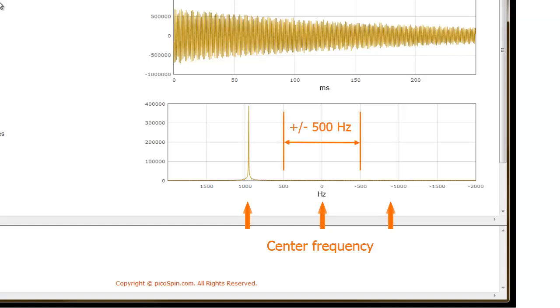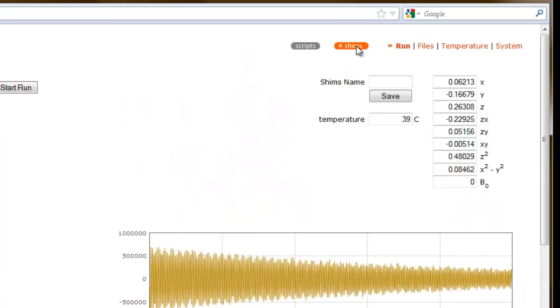For shimming, we need to place our signal within plus or minus 500 Hz of the center frequency. We'll adjust our signal's position shortly. If we navigate to the Shims button and select it, a new user interface field will appear.